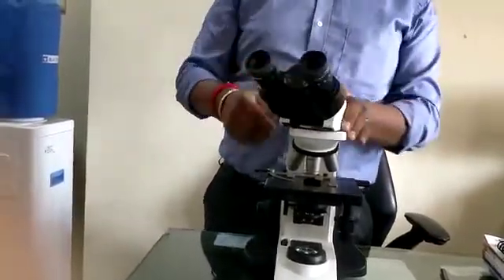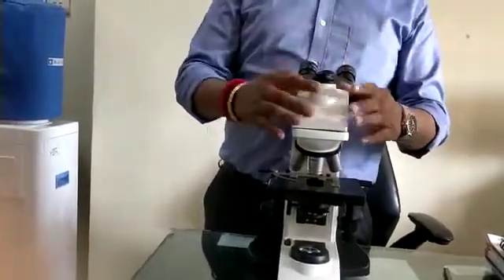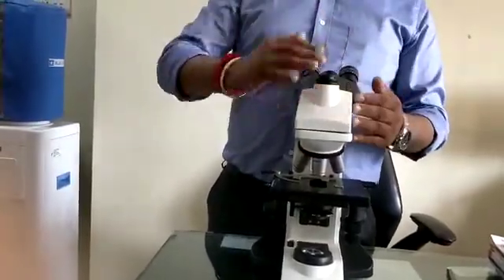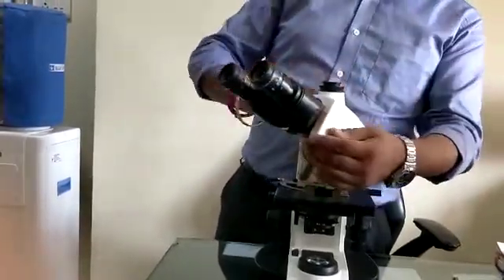No need to unscrew any screw — we can rotate it in a 360-degree way. This is a trinocular model. If you don't want a trinocular, you can buy only a binocular model. So two models are available: trinocular and binocular.